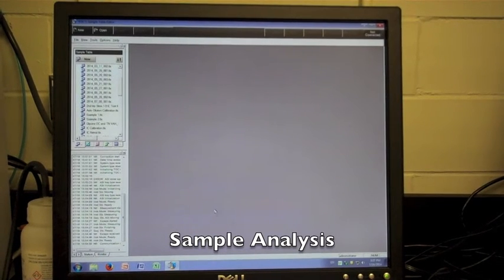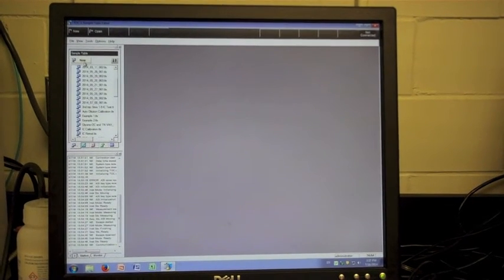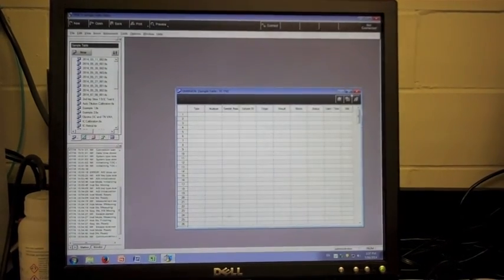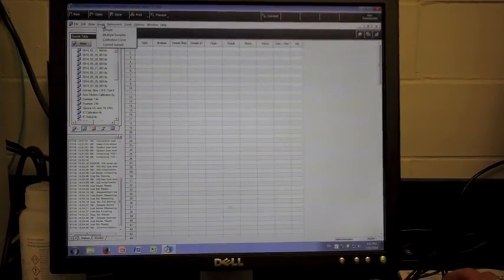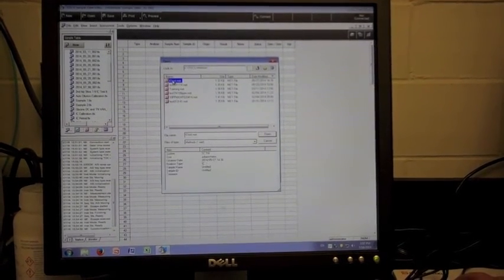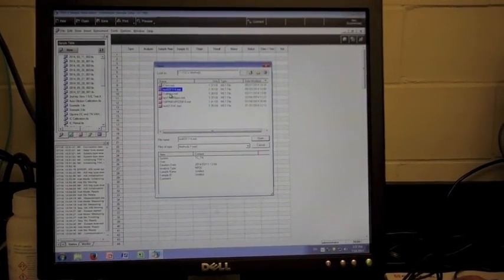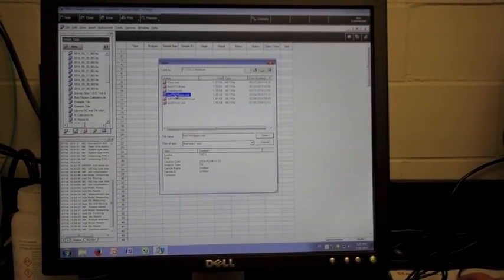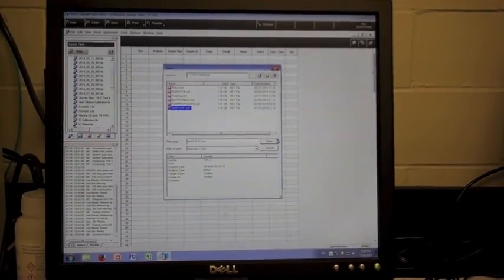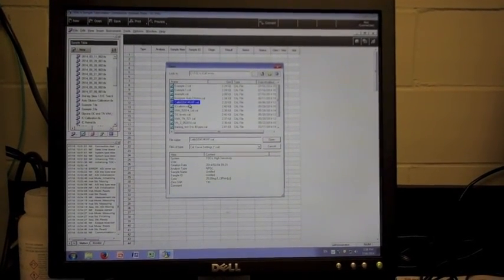When performing sample analysis, select the sample table option on the left side of the window, then select new. Proceed through the first window and the table will appear. Select the insert option on the top toolbar, but rather than selecting calibration curve, select sample or multiple samples. Selecting multiple samples allows running the same tests on a variety of samples. You will then select the proper method file for the test you would like to run — options include total carbon, total organic carbon, total organic carbon high sensitivity, total nitrogen, or total inorganic carbon. Once the proper method is selected, select the proper calibration curve file to suit the test you wish to run.